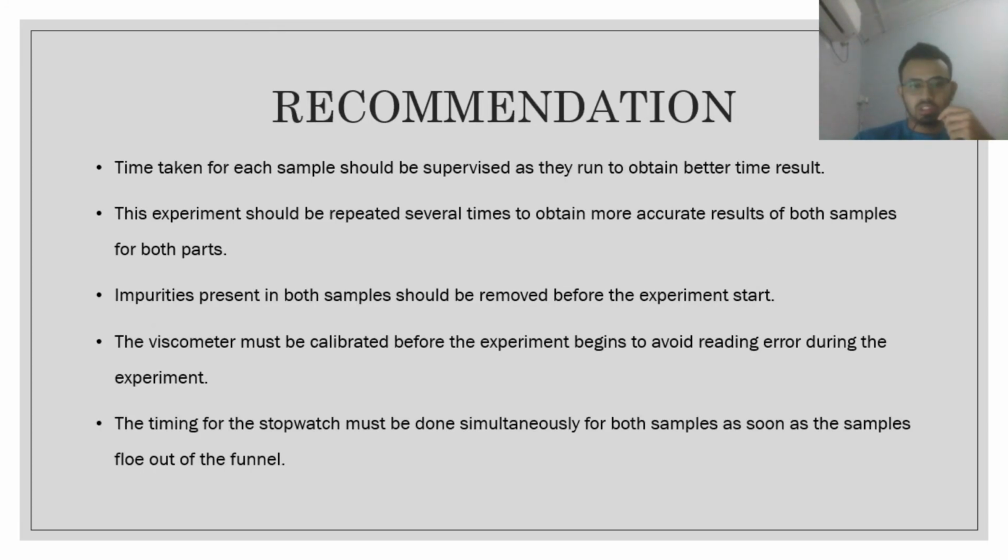The recommendations are: first, the time taken for each sample should be supervised as they run to obtain a better time result. Second, this experiment should be repeated several times to obtain more accurate results for both samples in both parts.